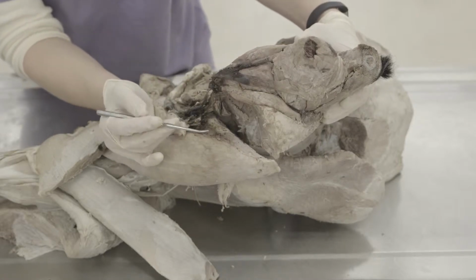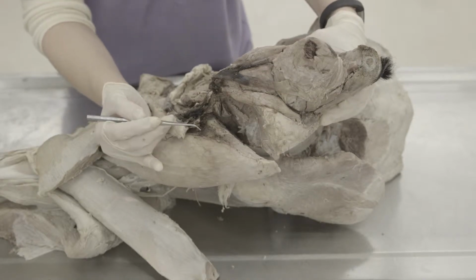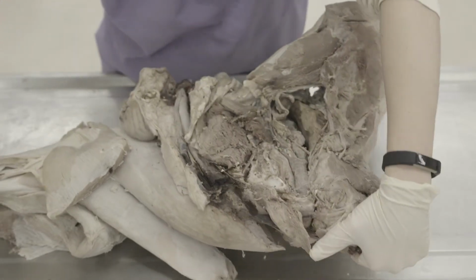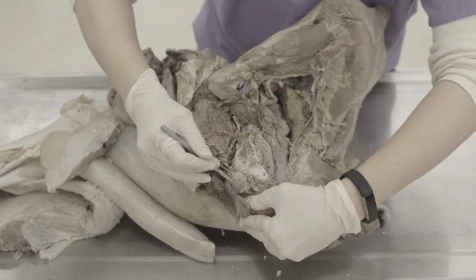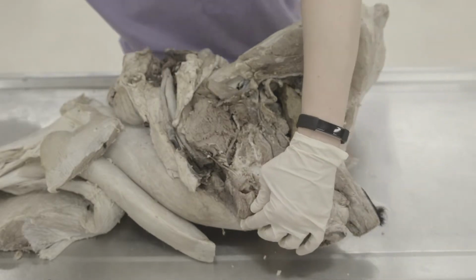And then the crus itself is composed of an erectile tissue, the corpus cavernosum penis, and that's surrounded by the tunica albuginea. So we cut open, I'll flip it over again here. We cut open the left crus so that you could see some of that erectile tissue inside.